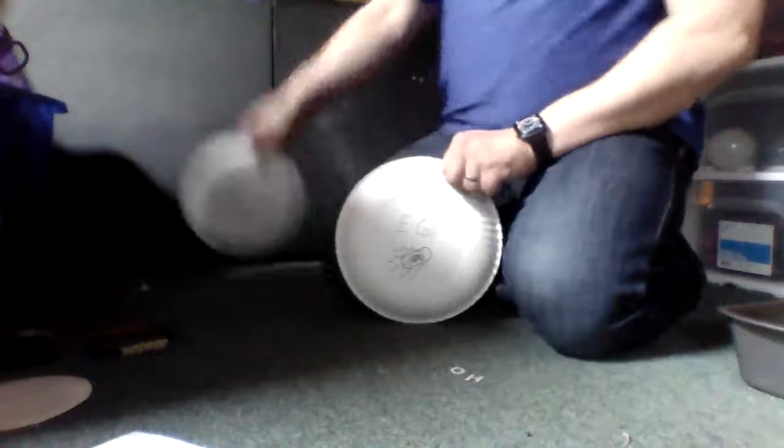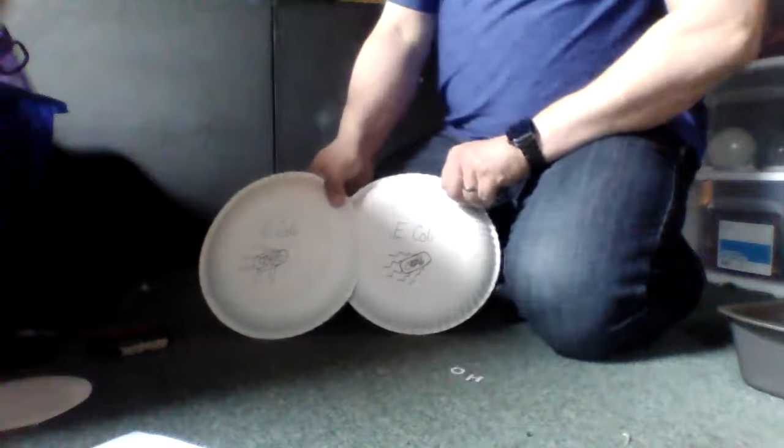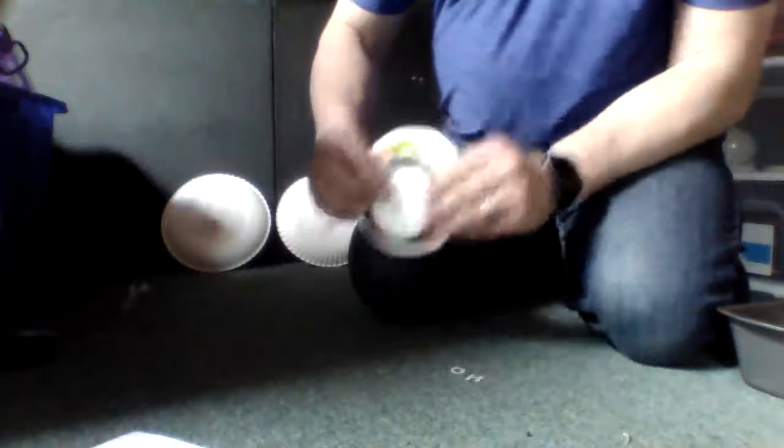Microbiology Bio 201, Bacterial Transformation Lab 5. So what we're going to do is start out with some E. coli, plain old E. coli, incompetent, nothing special about them. And we're going to take those and turn some of them green, or have them glow in the dark. We're going to do that by using this plasmid along with another solution.